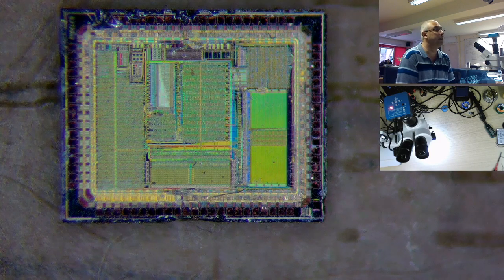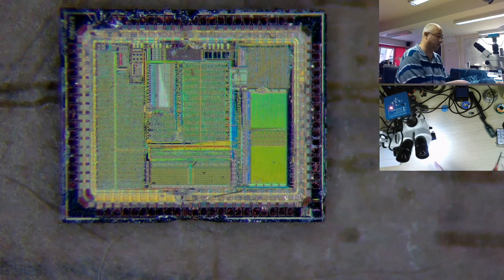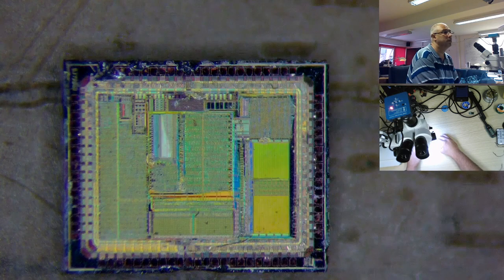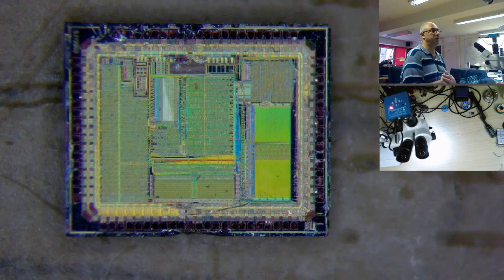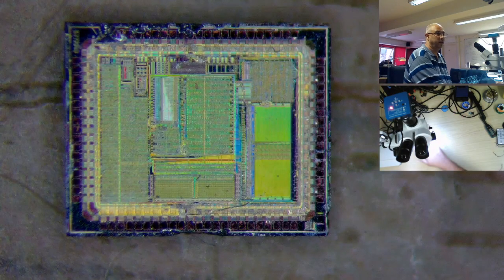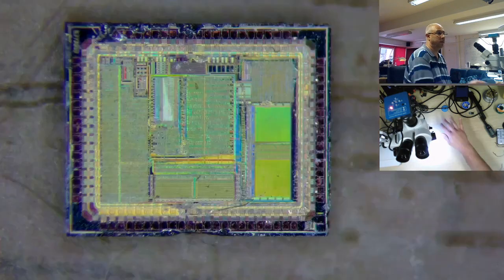If it's 30 frames per second on USB, I should see the image clearly stabilise when I move my object. Notice this — I go up or down, I'm going up and it's going down — this is how slow this is. Look at that — the pixels are awful, pixelated. I go left or right — I'm going left and the video is going right. This is how slow it is, about 3 frames per second. Really bad image, I don't like it at all. It's quite slow, quite jerky. I put my hand in there, my hand is out and the image is still catching up. Bad — not good at all.